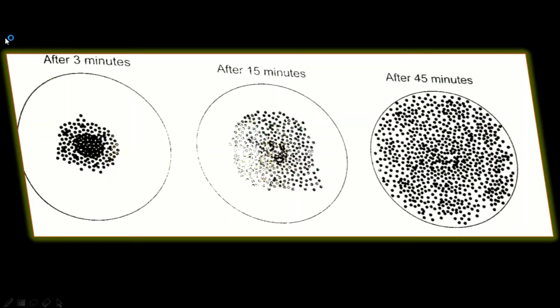After you are done adding in water, you want to leave your petri dish for some minutes. You want to see what will happen after 3 minutes, what will happen to your petri dish after 15 minutes, and what will happen after 45 minutes or rather an hour. Okay, so let's look at the results.